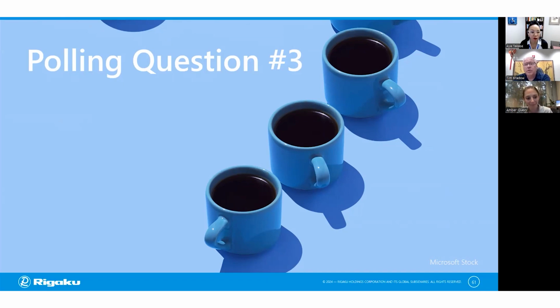And then the next question is more technical. The semi-quant analysis comparison for NCM looked great. When do I need to do calibration for true quantitative analysis? My usual way of doing it is to try it with semi-quant, test with a standard, and make sure: are you getting what you expect or not? In semi-quantitative analysis, you could have some variation. If you care about a difference of 1 or 2 or 3 or a few ppm in your material, that is a huge deal. In that case, I would definitely calibrate for it.